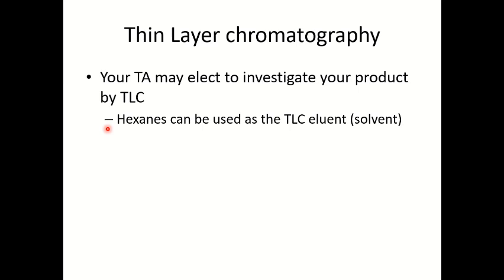It is a very interesting experiment for you to actually see what was your product. Even in organic chemistry, you must know that all reactions must be followed by TLC. It's the least expensive and the easiest way to identify the endpoint of your reaction and if your reaction was going well or not, right?